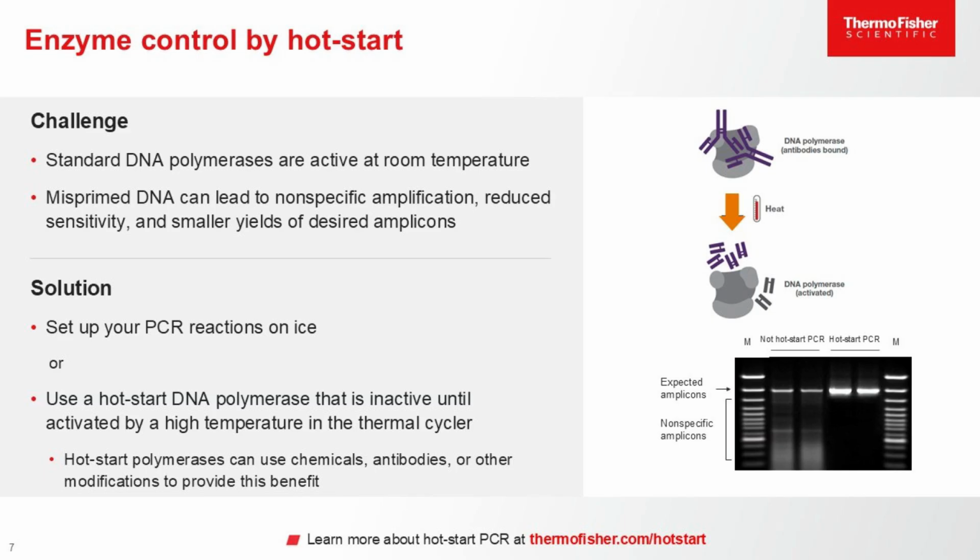Let's delve deeper into the concept of enzyme control through hot start mechanisms. Standard or non-hot start enzymes are active at room temperature during reaction setup. This can lead to amplification of nonspecific targets from misprimed oligos. Consequently, this can result in decreased yields of the intended targets and lead to reduced sensitivity that you can see in the figure in the bottom right, lane 2 and 3.